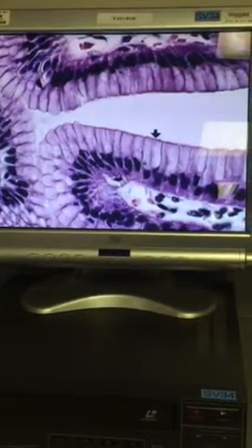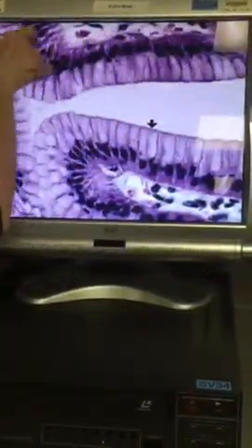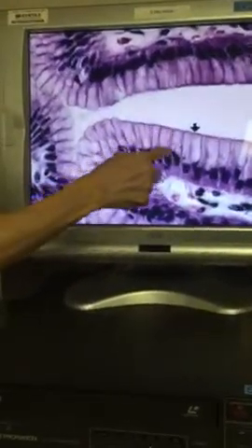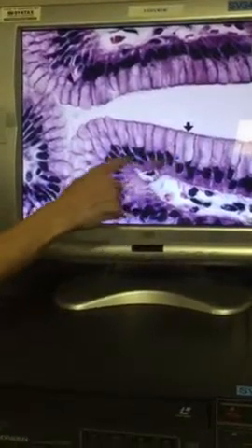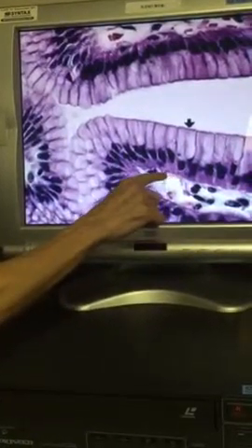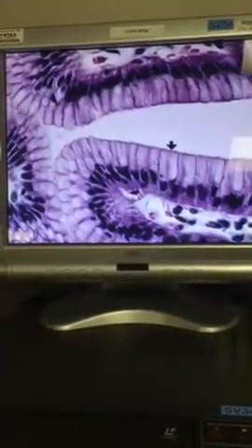And so in the stomach, the lining is folded up so that it can expand as we eat. So that's why it looks like there's folds in it. And you can see how rectangular these cells are. So usually in simple columnar, the nuclei kind of line up near the basement membrane, which is right here. So it's a pretty neat little row of cells usually.